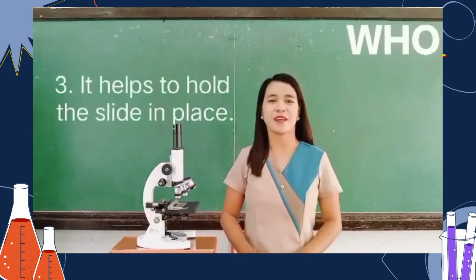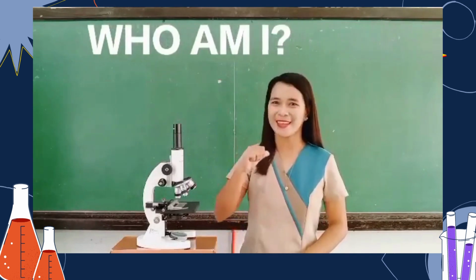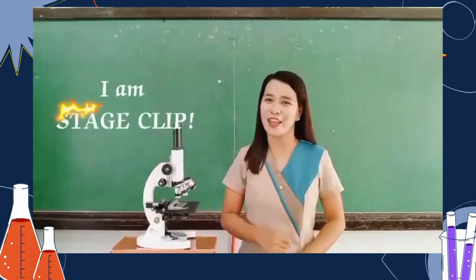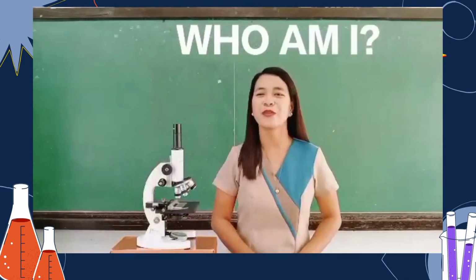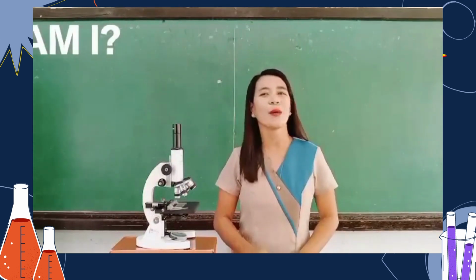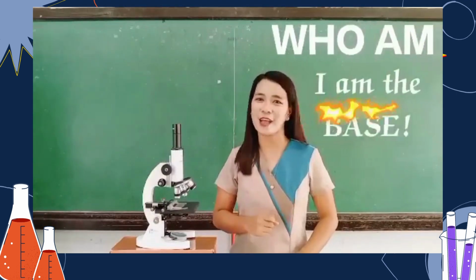Question number 3. It helps to hold the slide in place. Who am I? You are correct. I am the stage clip. Question number 4. It supports the whole microscope. Who am I? You are correct. I am the base.